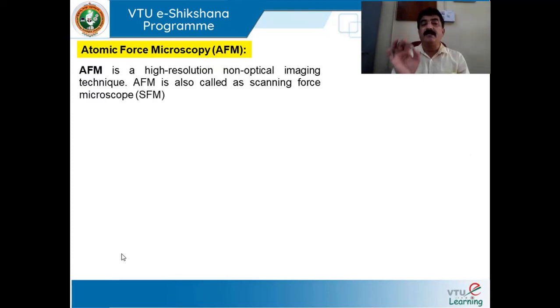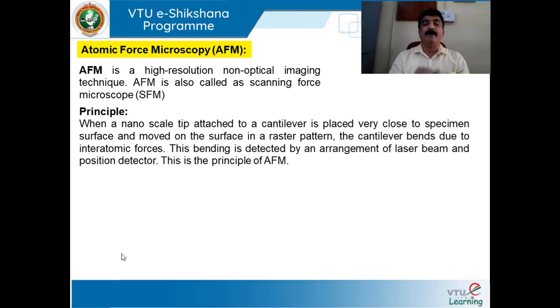It is a high resolution non-optical imaging technique. First of all, no source of light required, no lens arrangement required, either optical lens or magnetic lens. Okay, no lens arrangement required. That's why it is called a non-optical instrument. It is also called a scanning force microscope. Already we had one scanning microscope, that is scanning electron microscope, but this is scanning force microscope. So it is also called SFM.